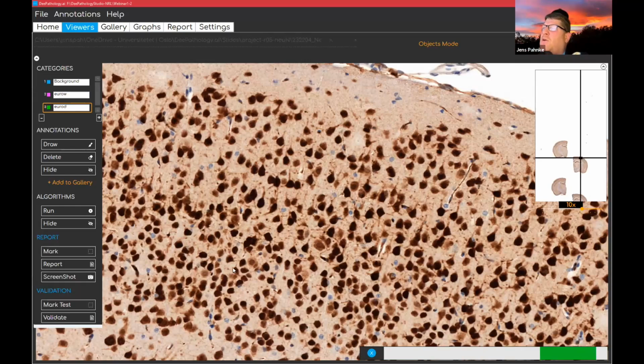It doesn't make sense yet now, actually, for some research purposes. It's just to show you that it can detect just different things. It could be different neurons as well, if you have different colors, for example, or different sizes, different shape, anything. So it can be anything. The software works detecting on size, on shape, on color distribution, everything.